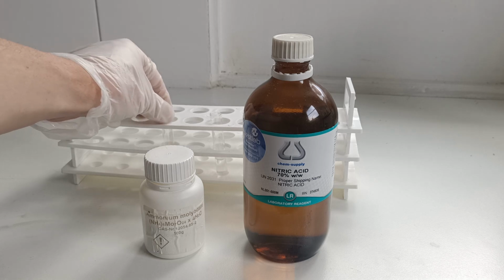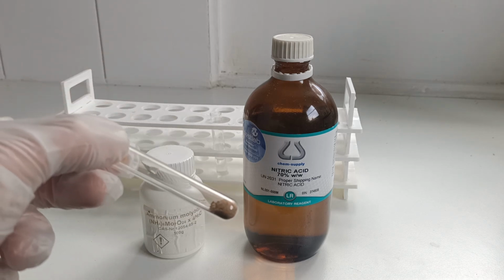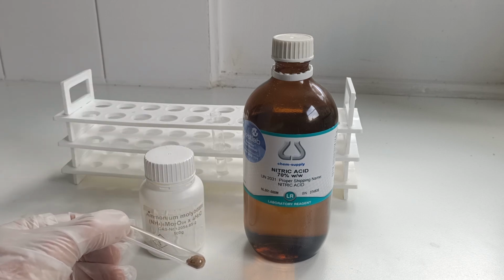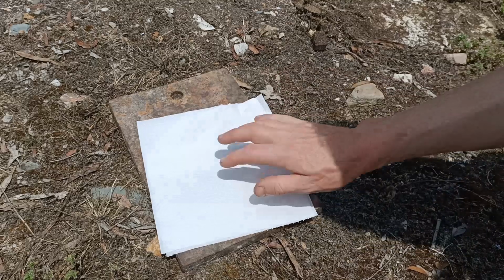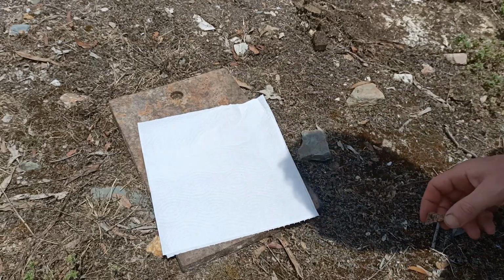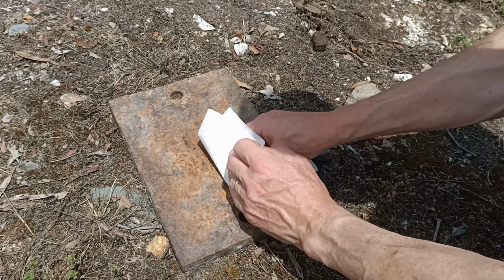So the test, we need some powdered sample in a test tube. I'll flick over to a bit of a handy hint on powdering samples of minerals. Okay, so you take a steel plate, take either a piece of paper towel or a bit of newspaper, anything like that will do. Newspaper's good, recycling. Hold it reasonably thickly, the sample in the middle.